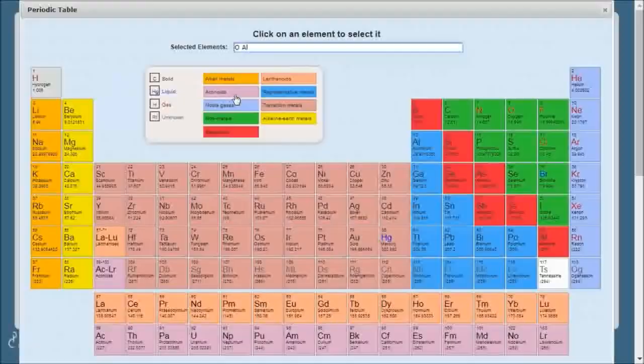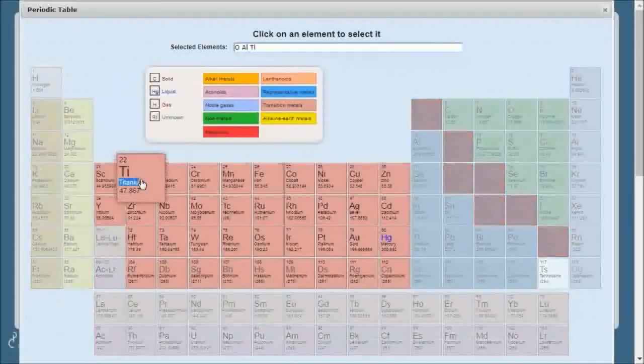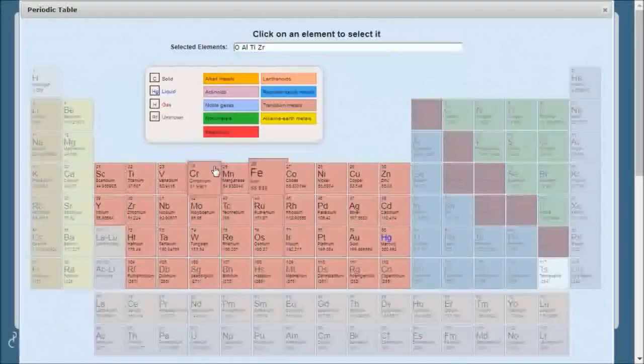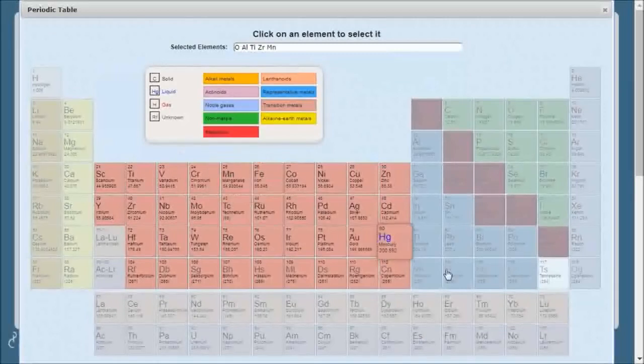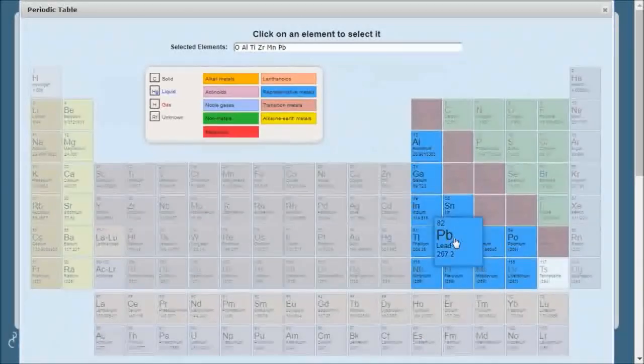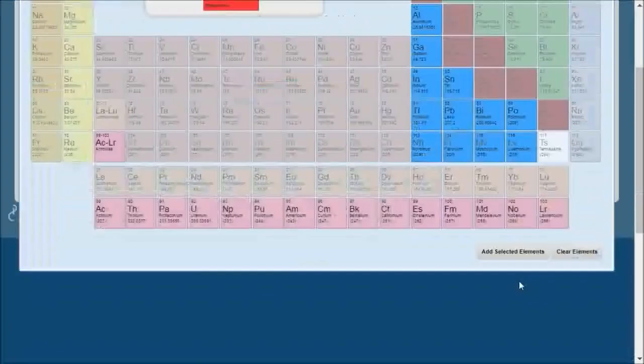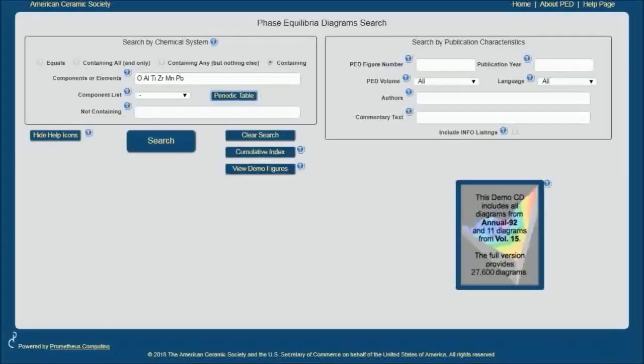The third option is the periodic table, and I'm using this to select some elements that make for some very interesting and useful ceramic systems. Once I'm done selecting my elements, I click add selecting elements and here they appear.